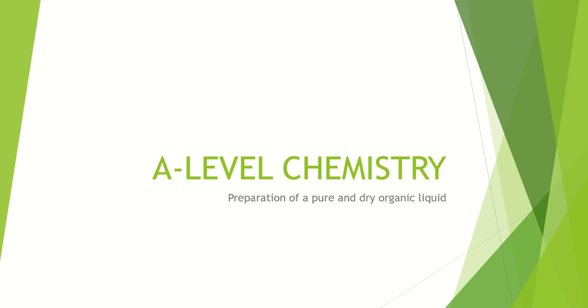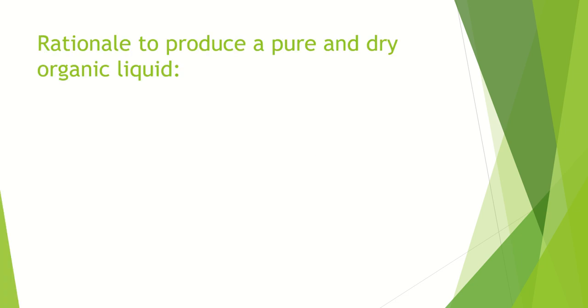We're going to make that from butan-1-ol. However, this preparation, this method, and all the techniques associated with it are analogous to the preparation of making any other pure dry organic liquid in the A-level chemistry syllabus. So you may well, if you're very lucky, in the examination be asked the specific one, but if you're not, the methods, the strategies, the techniques to make the pure dry liquid in this will be the same as those for any other organic liquid, even though the product itself would be different in that instance and the reactants, of course, would be different.